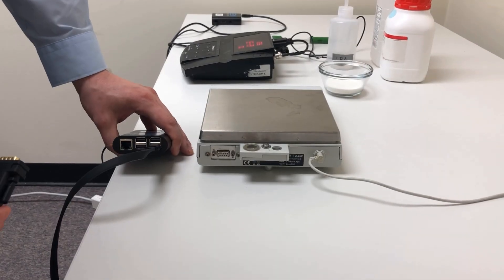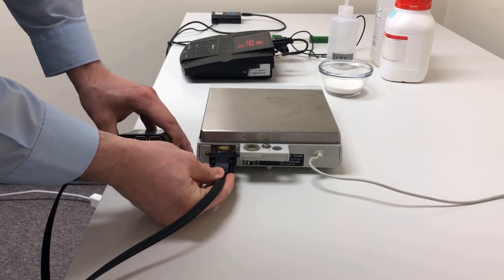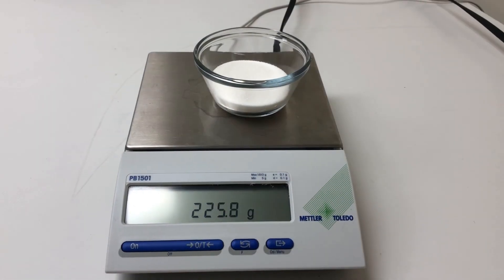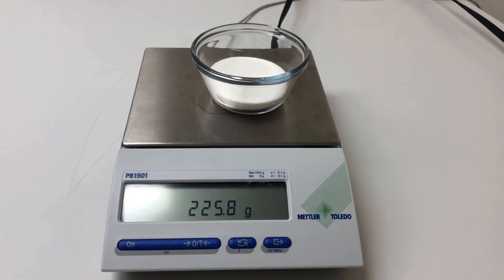The ElementD connects to your equipment via RS-232, Ethernet, or USB. The ElementD automatically records and transfers data to your dashboard. The ElementD creates a digital audit trail by capturing and storing data every 15 seconds.